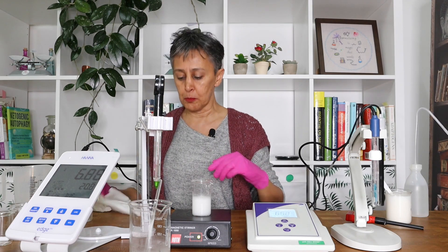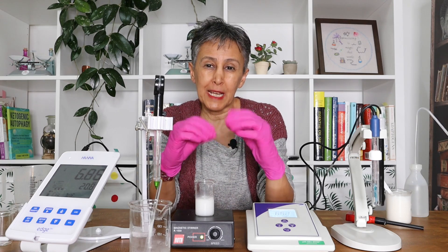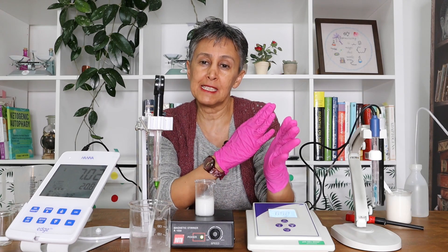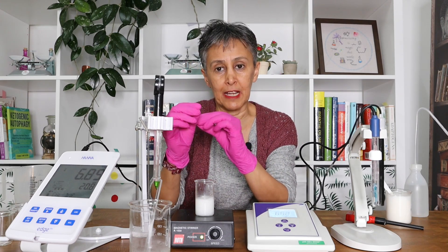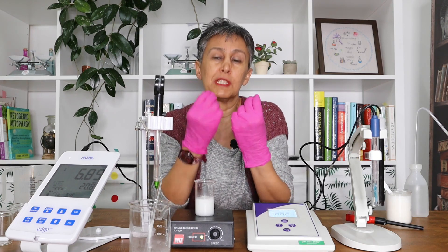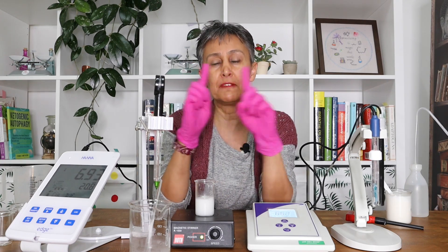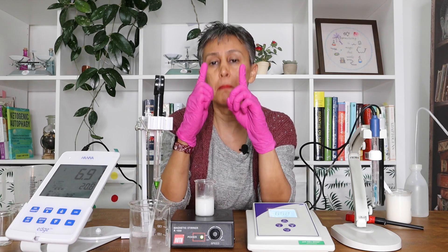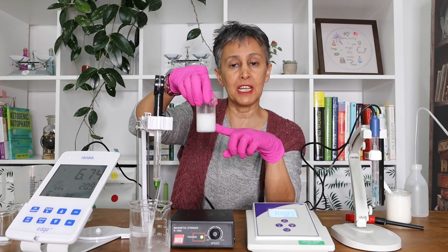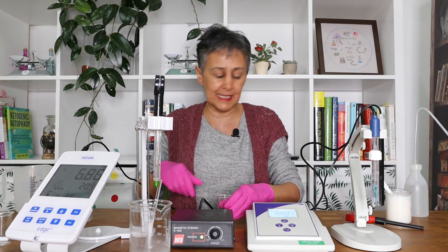When you want to measure the pH, the pH is actually an electric current between the reference electrode and the measuring electrode. They are all combined here — you cannot see them, but when you go into the anatomy of an electrode, you have two electrodes, and the current between them is measured as a pulse and you see the number as a pH.